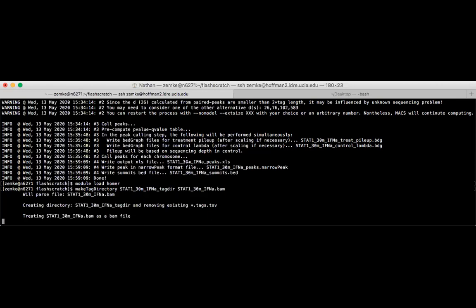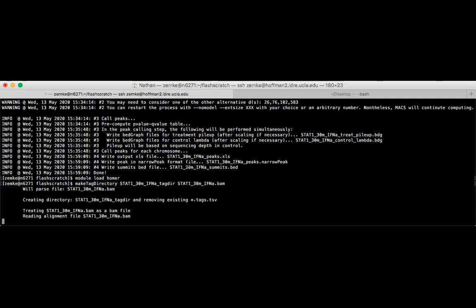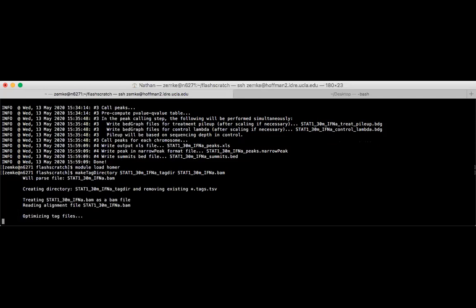With these peaks that we are determining as differentially represented between the two different time treatments, you can use those for whatever you want, really. You can see which genes these peaks are associated with. You can see what transcription factors might be binding there by looking at transcription factor motifs. These are things we'll be doing tomorrow. After we do this differential peak calling, we'll be done for today. And tomorrow we'll do some more visualization of the data.